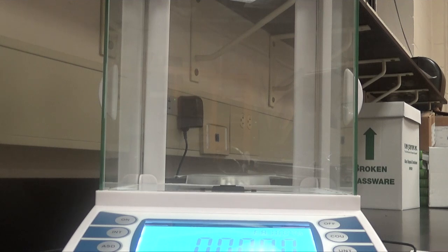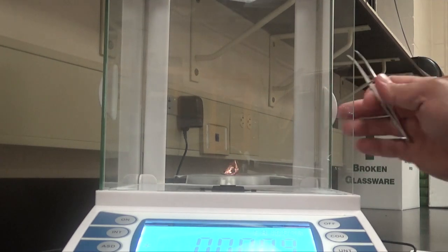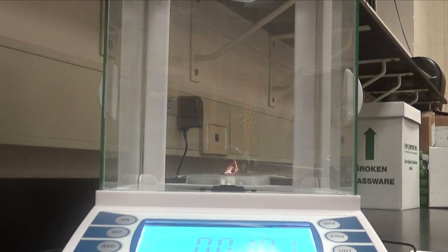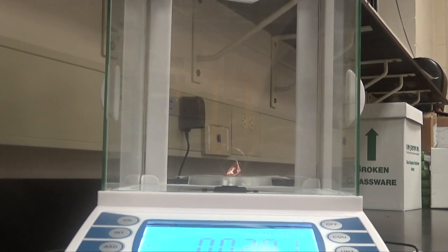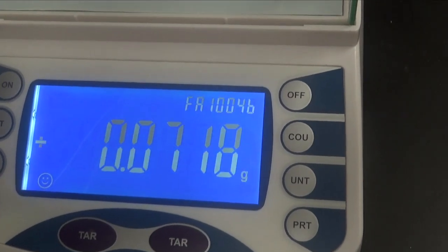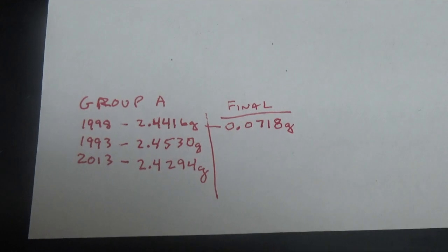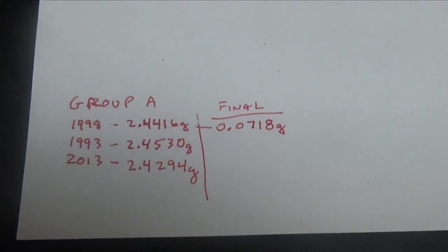I'm now going to take this penny and place it on the balance. As you can see, the mass of this penny is now 0.0718 grams. Now I record that data on my original sheet for group A.